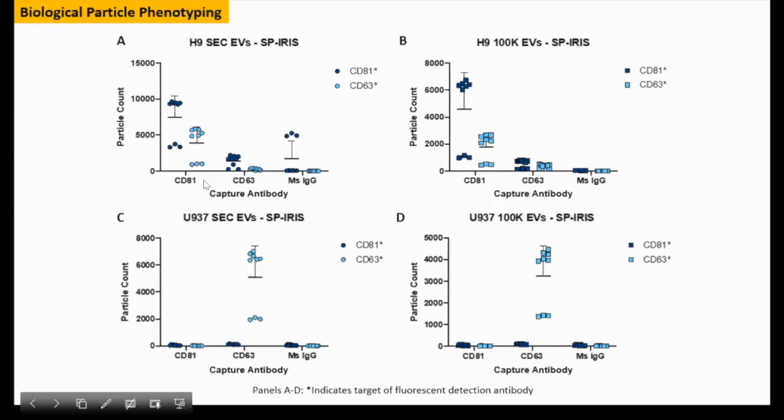So we thought that this is a good observation to share with you today. And this phenomenon is observed independently of the method that we applied. So it's true for SEC EVs and 100K EVs. Next, please.